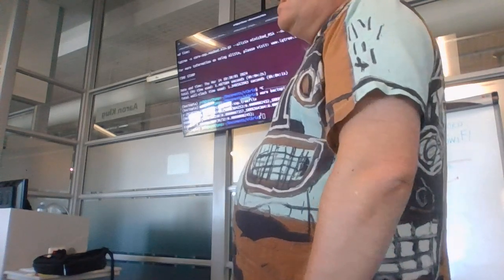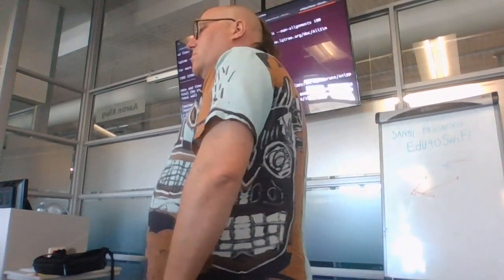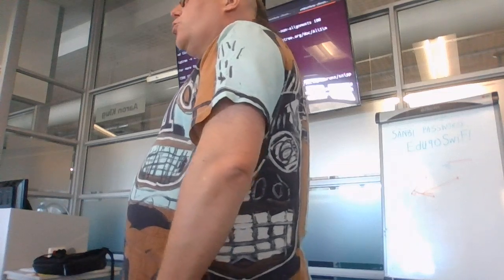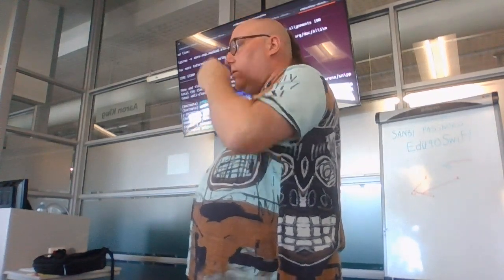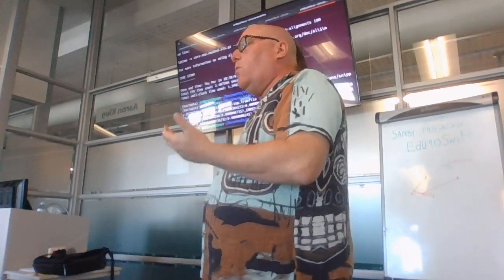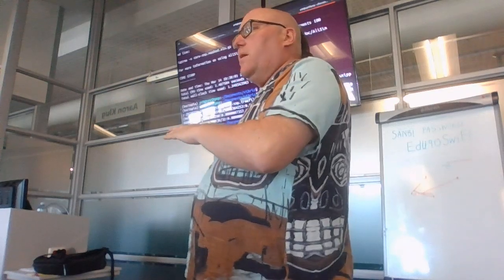Okay, so when we run clean your reads, we know the samples it has. So when we run Snippy... Oh, what we didn't do is look closely at the MultiQC output to decide to exclude certain samples. What we didn't do is a lot of pre-checking. What we could have looked at in the MultiQC output is whether the number of reads present is too low, or the GC value is off, or there's something else that makes you think don't take this analysis further.